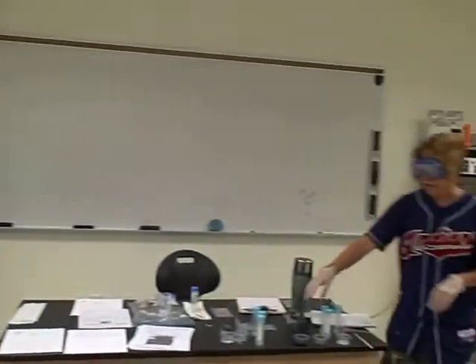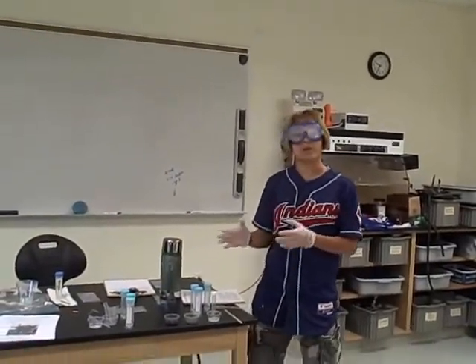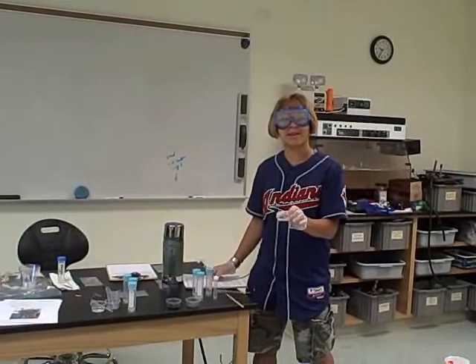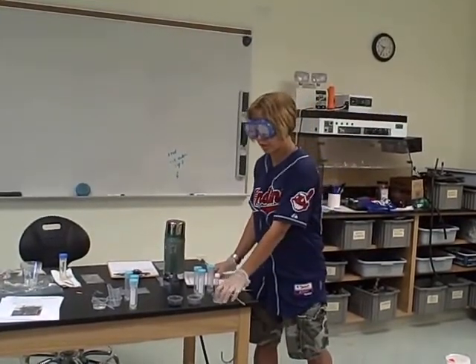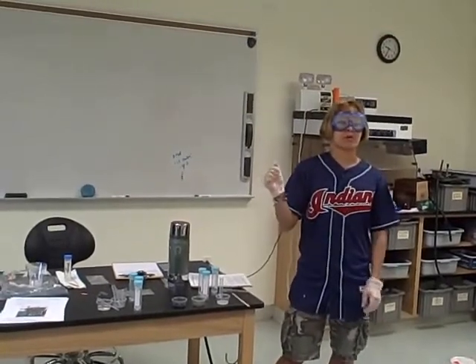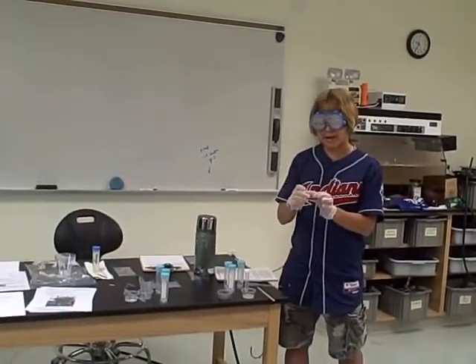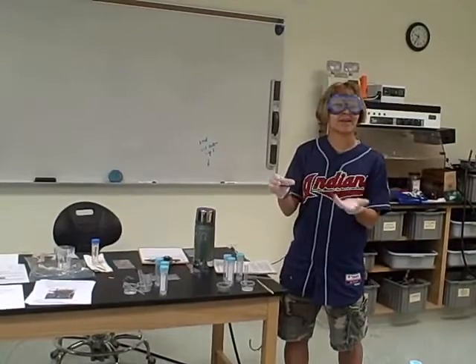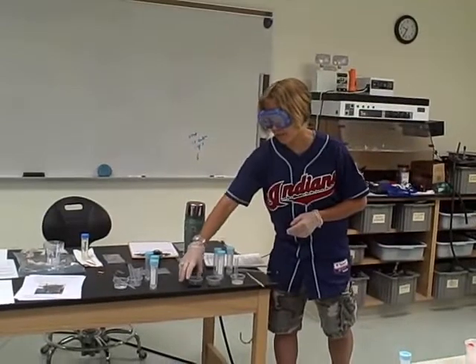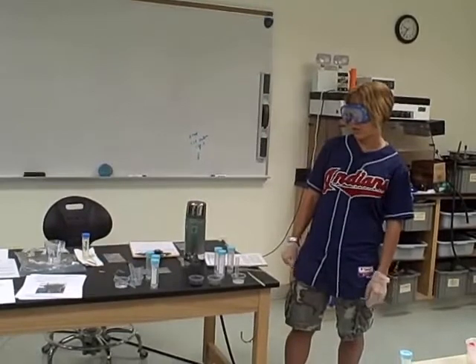Just one last note in terms of disposal. If you're getting rid of this at the end of the day, it's fine for it to go down the drain, but be aware that the borohydride's going to just keep reacting, and if it's not all consumed before the end of the class period, when you pour it down the drain, it's going to fizz a bunch. So you want to run a bunch of water. The volumes, again, are smaller than we originally designed, but what's going to happen is that you're going to end up pouring a bunch of black junk down a library drain, and there might be some questions about that. So make sure that you rinse sufficiently with additional water.